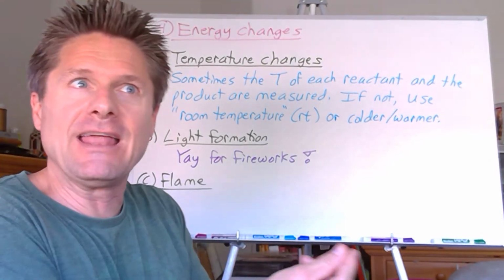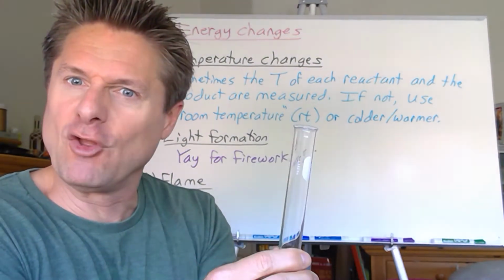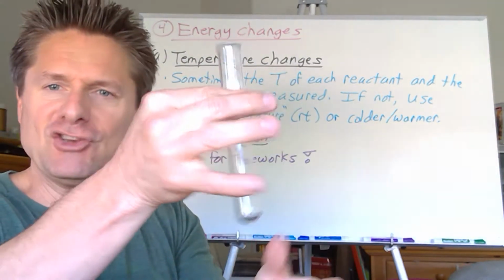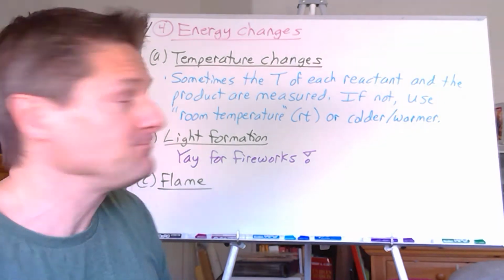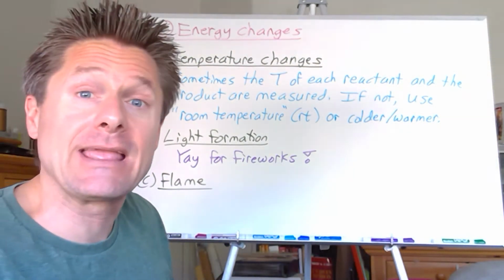And then you can feel it, and you have to do it pretty quick. When you mix it, you want to detect an odor, and then feel, because that temperature change can be pretty quick. So after you shake it, feel: does it get warmer than room temperature, colder than room temperature, or stay at room temperature? You want to note that, all right? Because if it's noticeably colder or warmer, that's an indication you had a chemical reaction.